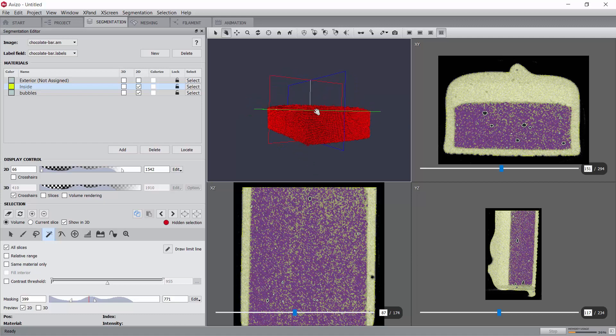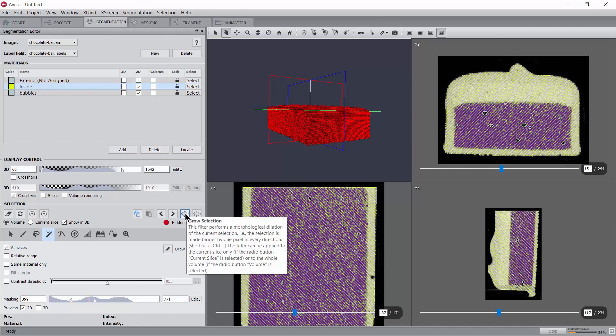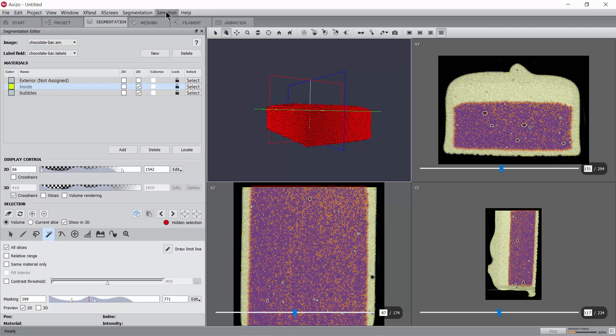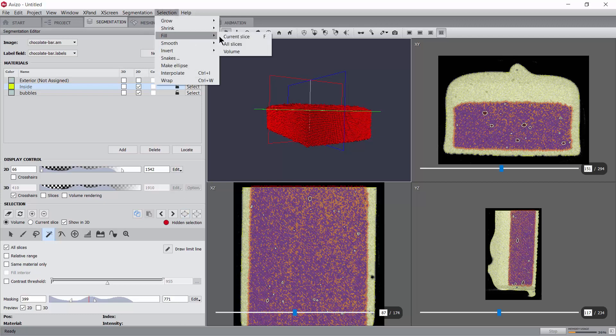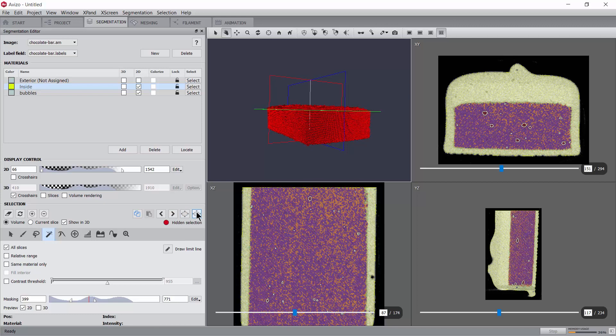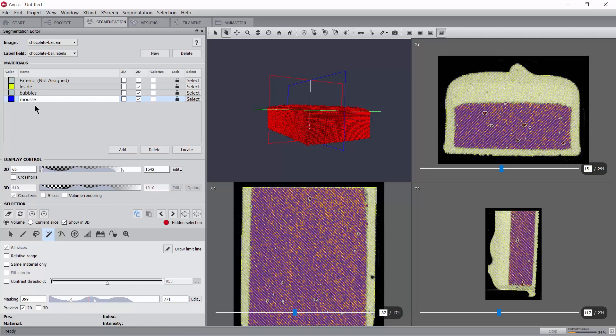As the original image is fairly noisy, the obtained selection contains lots of holes and irregularities. In order to smooth them out, we will grow the selection three times, fill holes and shrink the selection back. If only smoothing is intended, you should grow and shrink the same number of times. Now, let's lock the bubbles material and assign the selection to the mousse material.